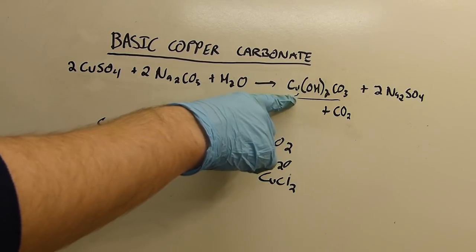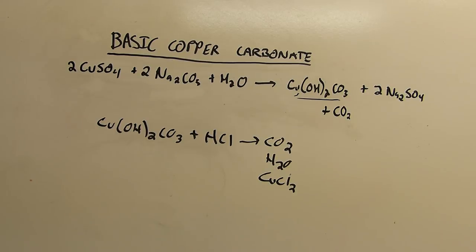This basic copper carbonate is quite insoluble in water, and so it will precipitate. It's a light blue precipitate, which will be filtered from the water, and then we can dry it and store it for future use.